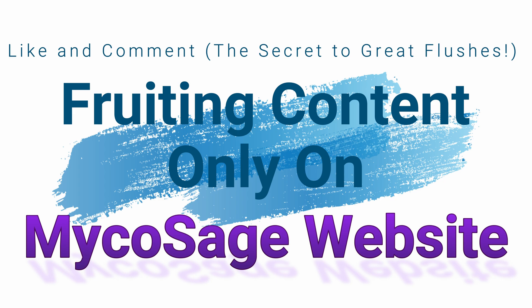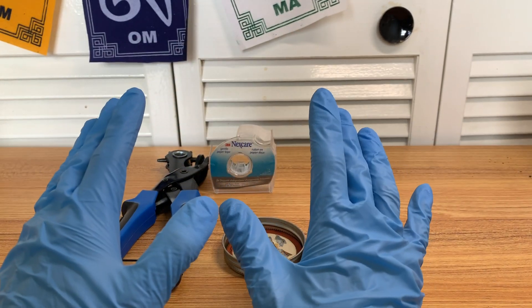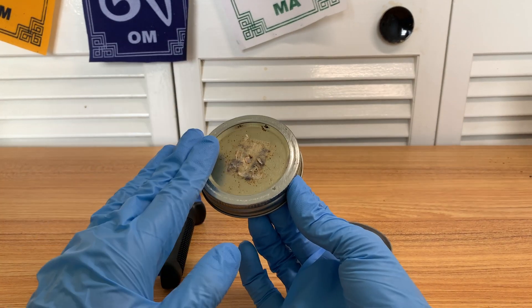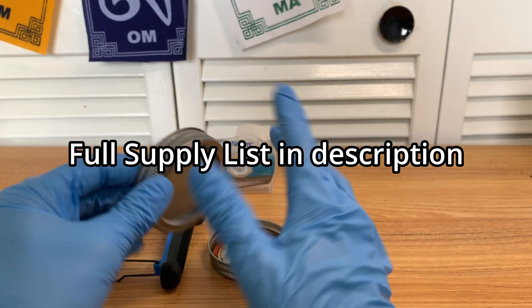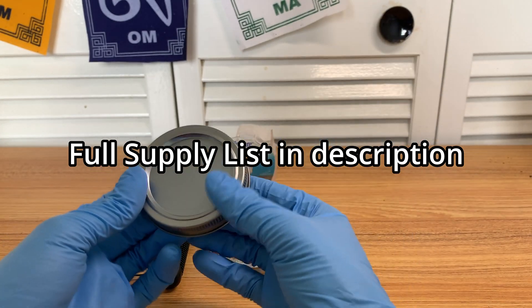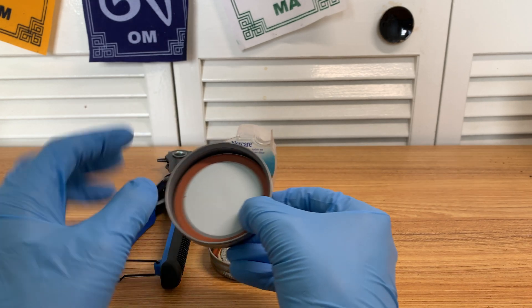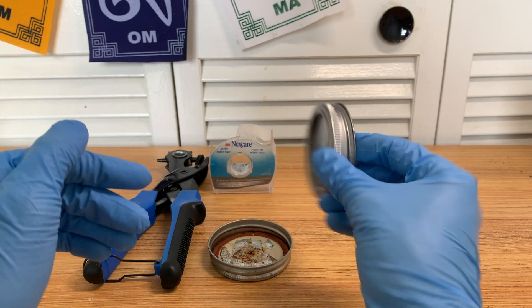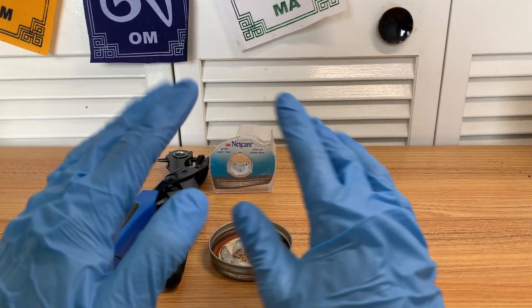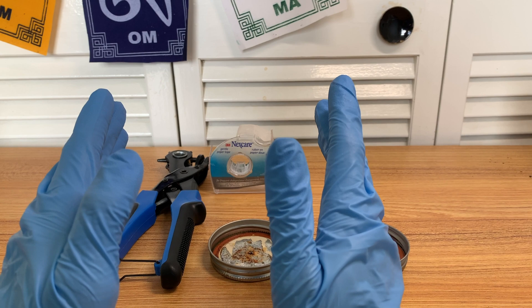This video is officially part three of the Mushroom Mastery series. For those following that series, we're actually going to be using the modified version for your first grow. But later on, we're also going to be doing some agar work. When we get to that agar work part, we're going to be using unmodified lids, because that's basically what I prefer nowadays. But let's quickly cover what grain jar lids do.